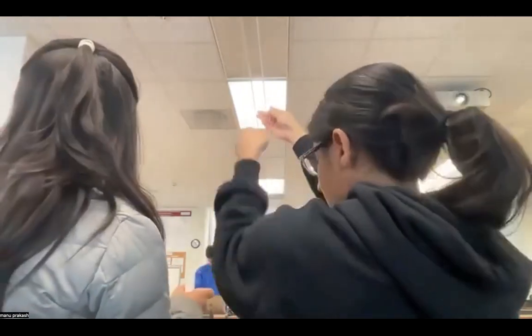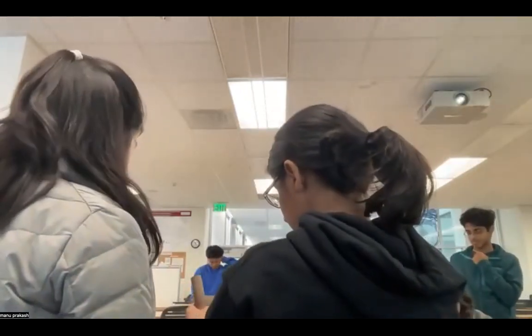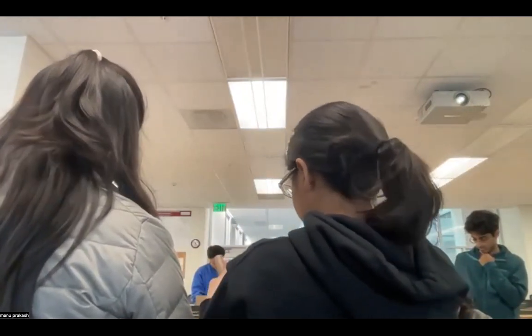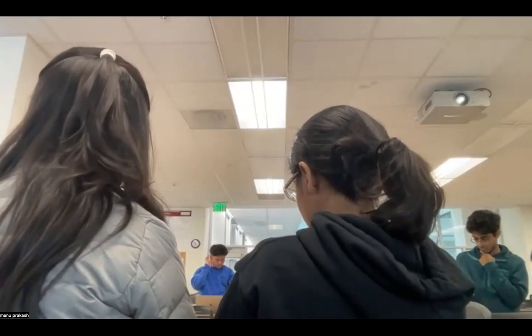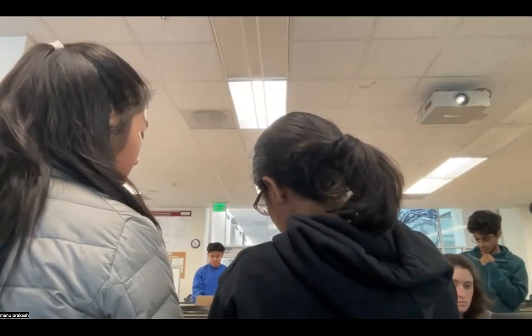So the trick, whenever you're starting, is you first pinch the two hands and then just load the torque. You are loading a twist configuration and giving it enough time so that in the first go, you can get it started. Also, you don't need to pull it for too long. If you pull it for too long, you're fighting the counter rotation. And it's about learning that frequency.